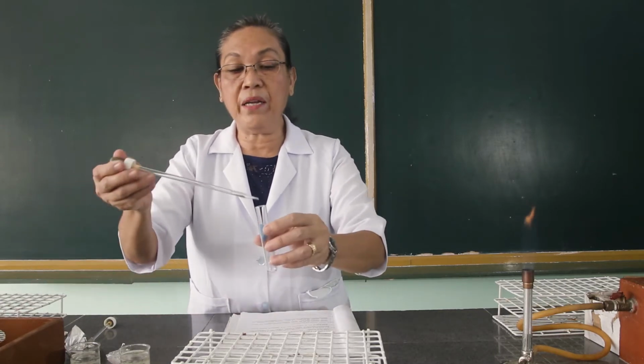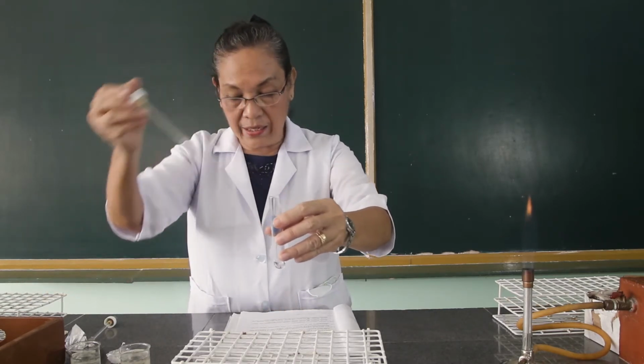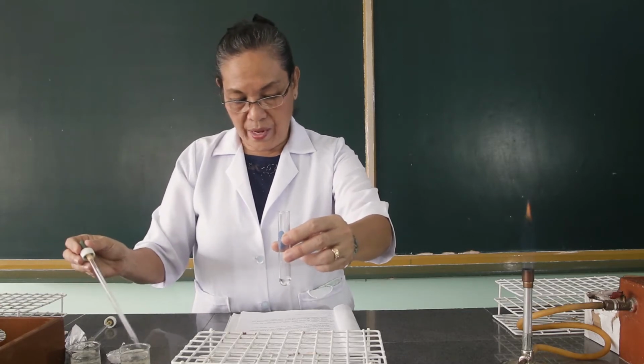So to 1 ml of the magnesium chloride, let us add 2 drops of ammonium carbonate.